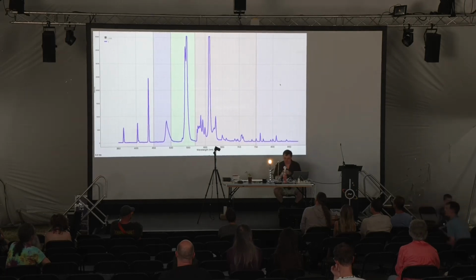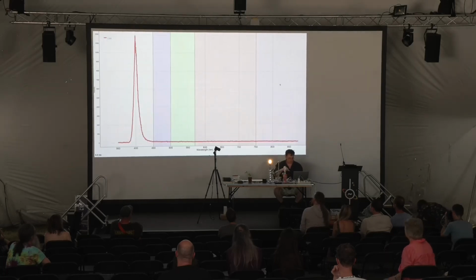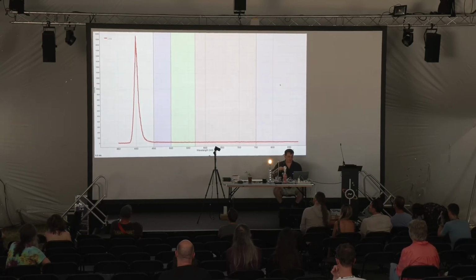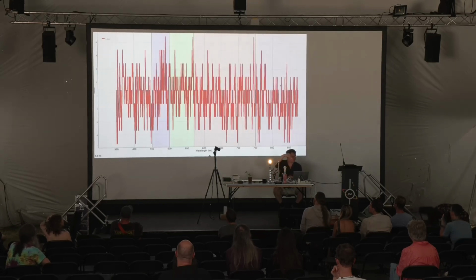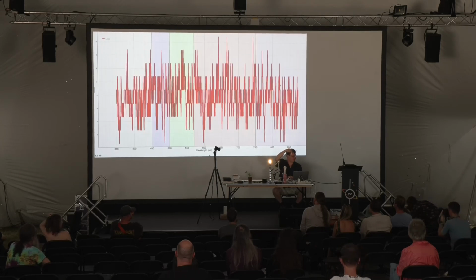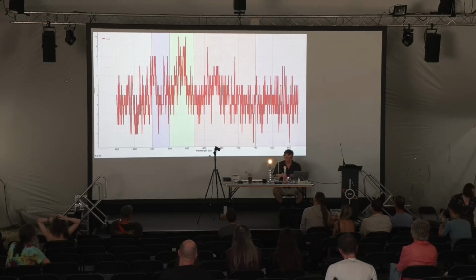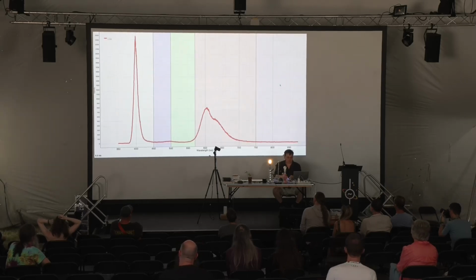And we can actually see how this works with this ultraviolet torch I've got here. So if we, oh dear, there we are, it's working, good. If we turn this ultraviolet torch on, you can see we're getting a peak here, the other side of blue, so into the ultraviolet part of the spectrum. And I've then got some fluorescent paint here that I borrowed from my son's science kit, thank you Julian, and I can point the ultraviolet light at this fluorescent paint, and we can see what we've got here.